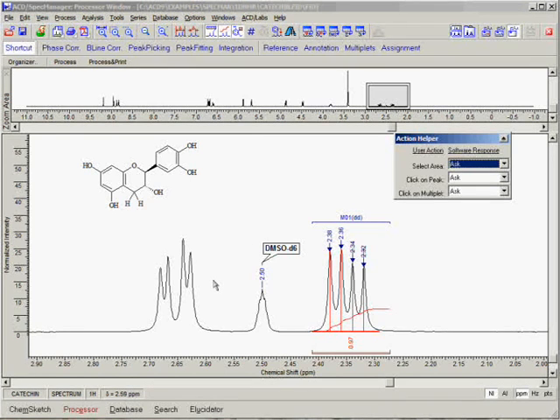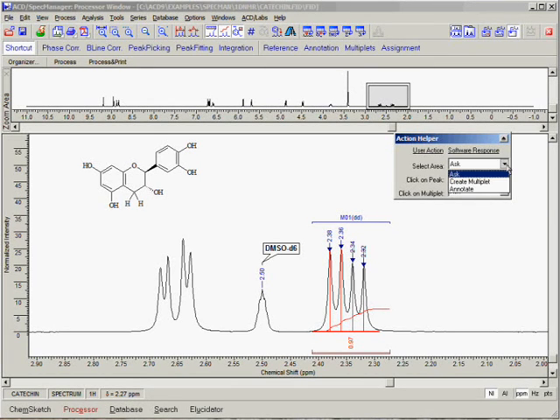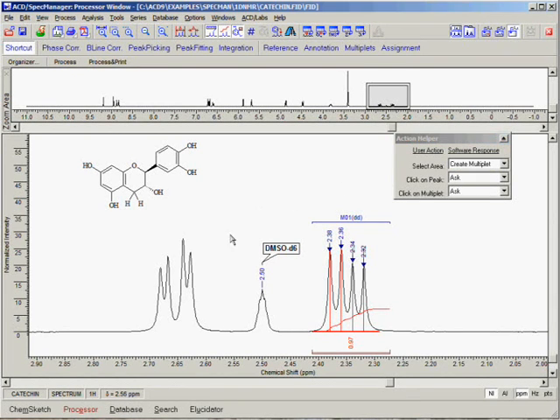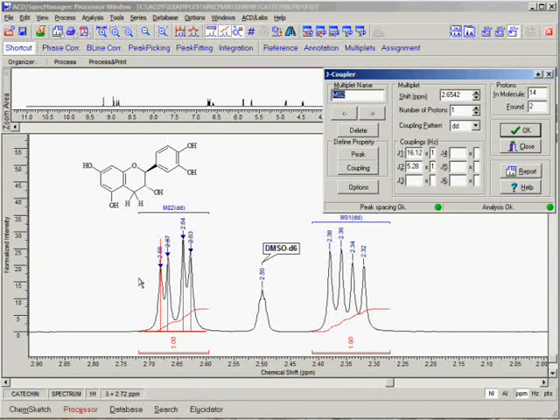Before we do that, however, we are going to change some settings in our Action Helper dialog box. Remember that when we clicked and dragged across a multiplet, the software asked us to choose if we were intending to annotate that region or create a multiplet? This additional mouse click can be avoided if we change the Select Area setting in the Action Helper dialog box from Ask to Create Multiplet. Now you can see that by simply clicking and dragging across a multiplet with the left mouse button, a new multiplet is automatically created.